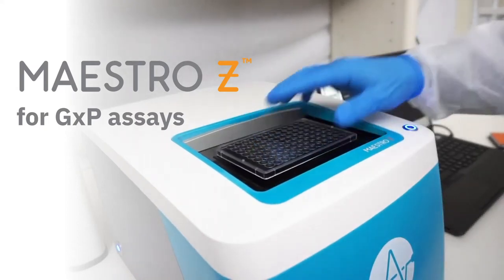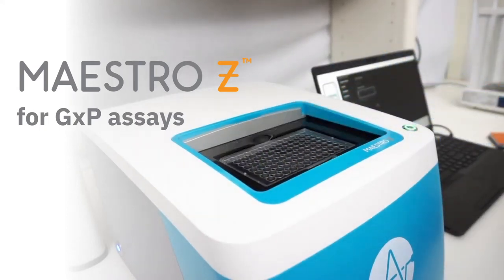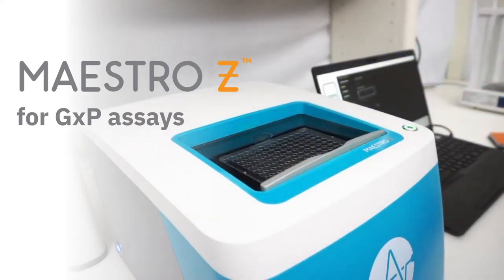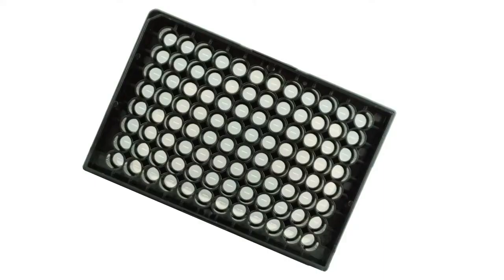Announcing the Maestro Z system, now for GXP assays. The Maestro Z system lets you track your cell biology label-free and in real-time.